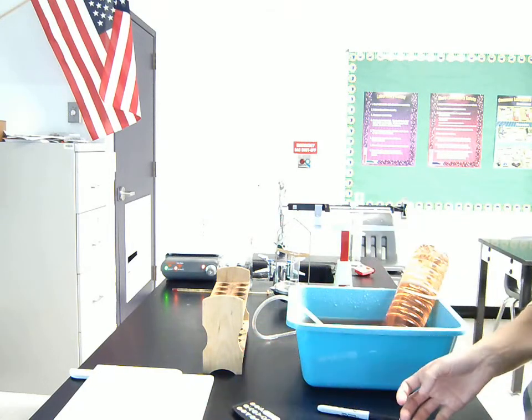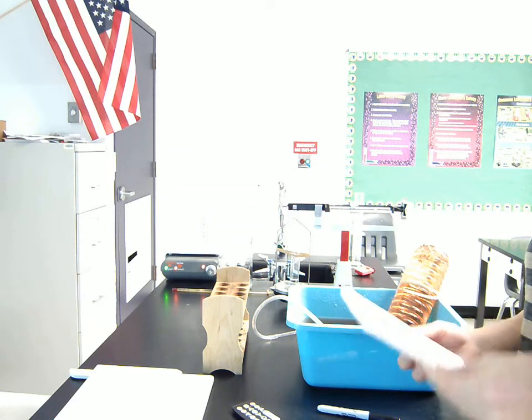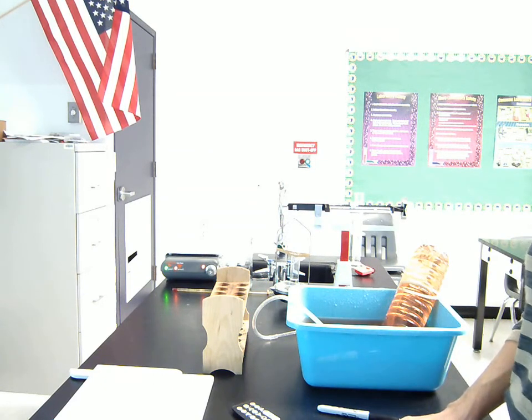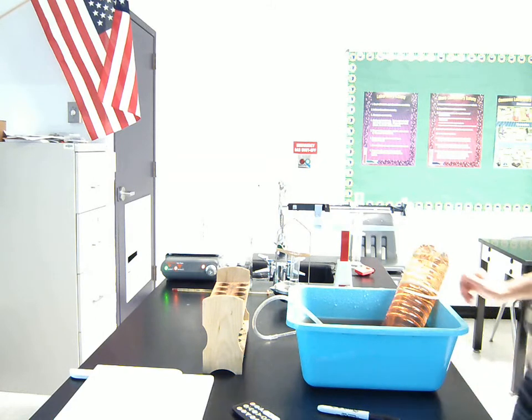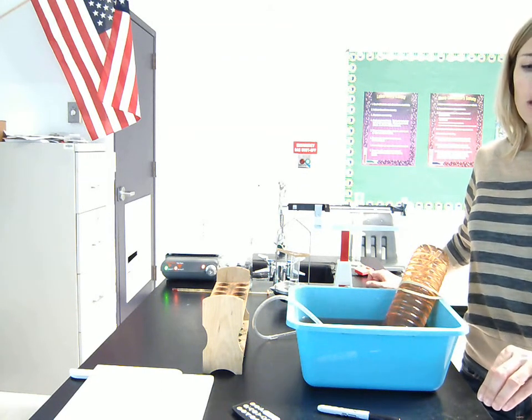Alrighty, so this is the lab on density of a gas. The purpose of this lab is simply to determine what the density of a gas is, which seems like a very simple kind of purpose, especially when compared to the lab we did on density of solids and density of liquids. In those two labs, what we were doing was measuring the densities of similar looking solids to compare them to see if they could be the same substance.